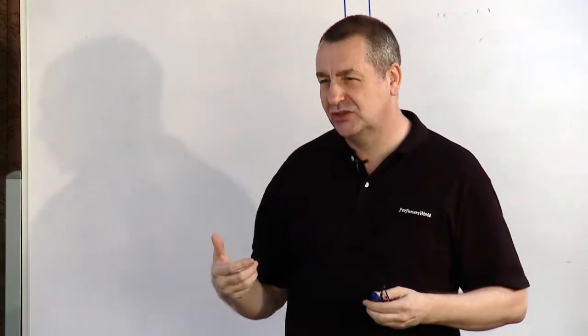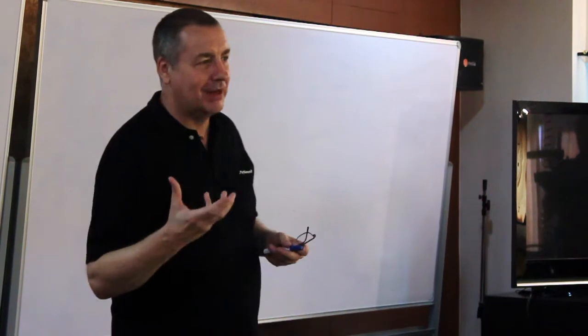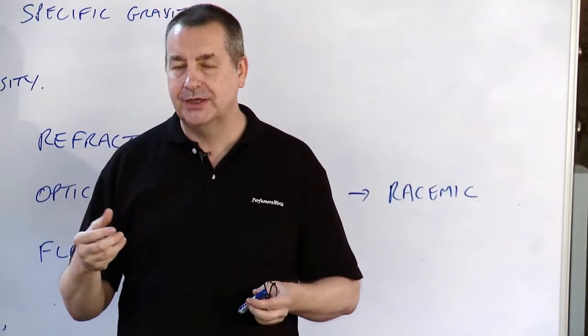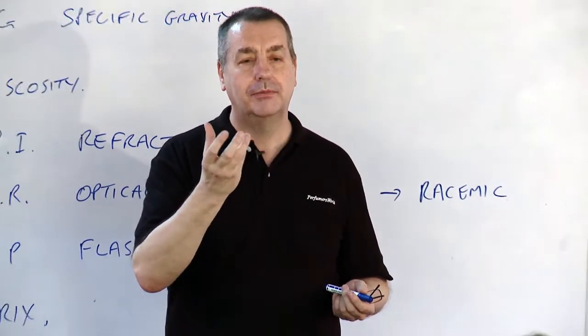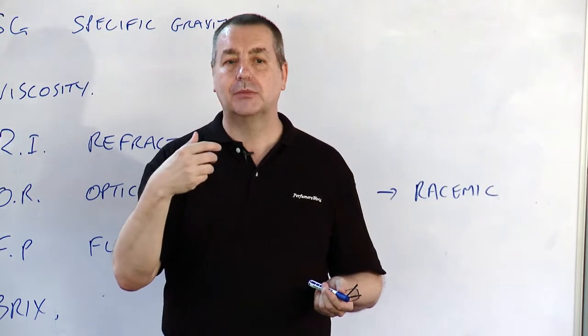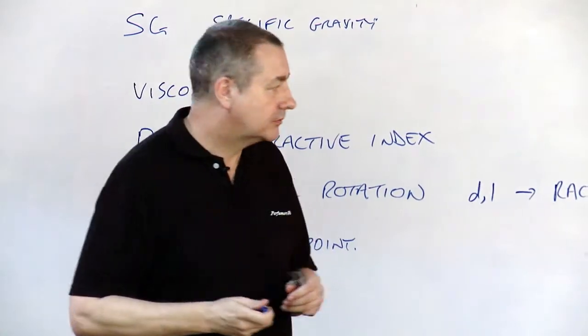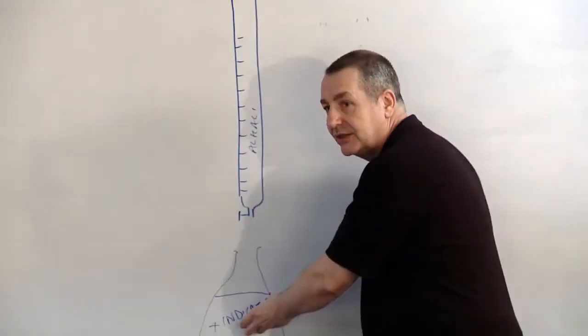When we talk about pH of perfume materials, it's generally not that much off of 7, yeah? It's not really interesting for us, but there are some materials where it is important, things like benzoin, yeah? Gums and resinoids, they have an acid value that can be measured. A solution is made of the material with an indicator that changes.